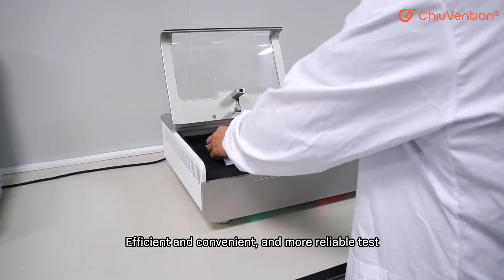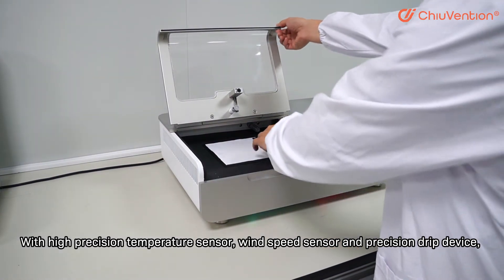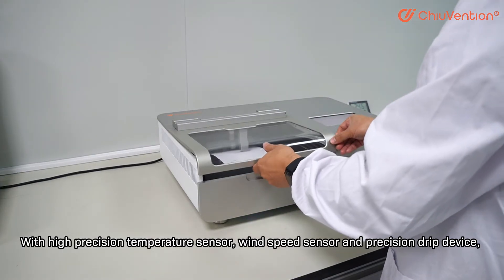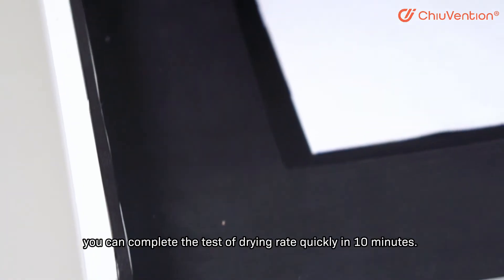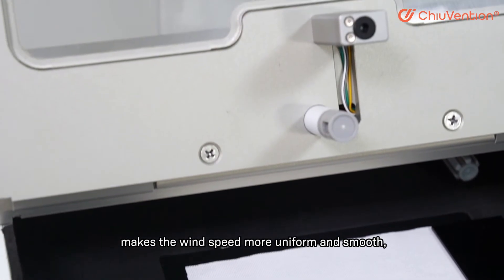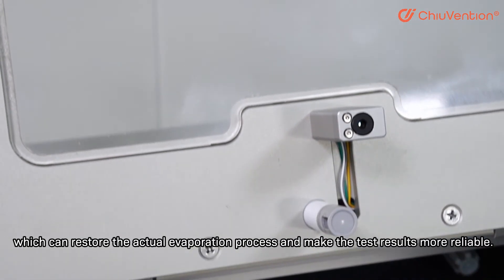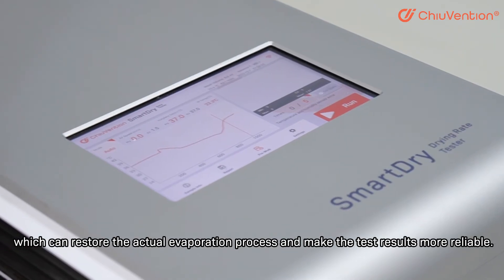With a high precision temperature sensor, speed sensor, and precision drip device, you can complete the drying rate test quickly in 10 minutes. The specially designed parallel cross-flow fan makes the wind speed more uniform and smooth, which restores the actual evaporation process and makes the test results more reliable.